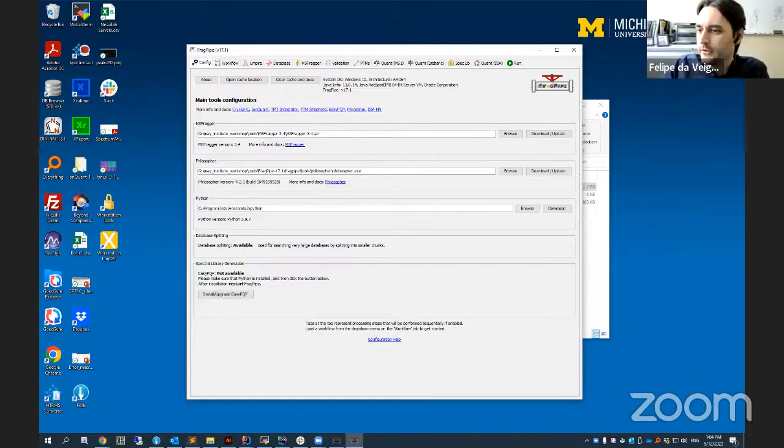Fengchao, maybe we should read the question as well, because for the YouTube recording, I don't think they have access to the chat. Yeah, so someone's asking if FragPipe is free software or if it needs a license. As Fengchao was mentioning, pretty much all the tools are open source and free to use, with the exception of MSFragger, which will depend on whether you're in a company or in your research institute.